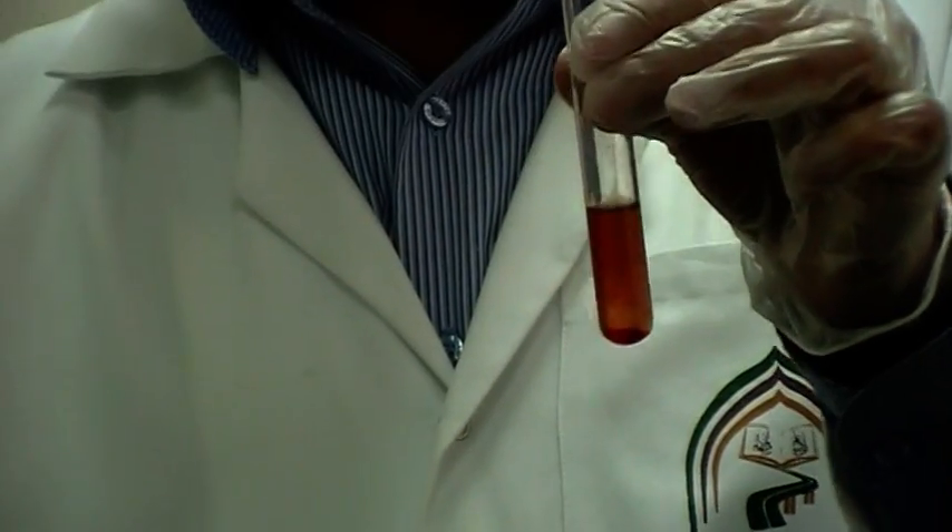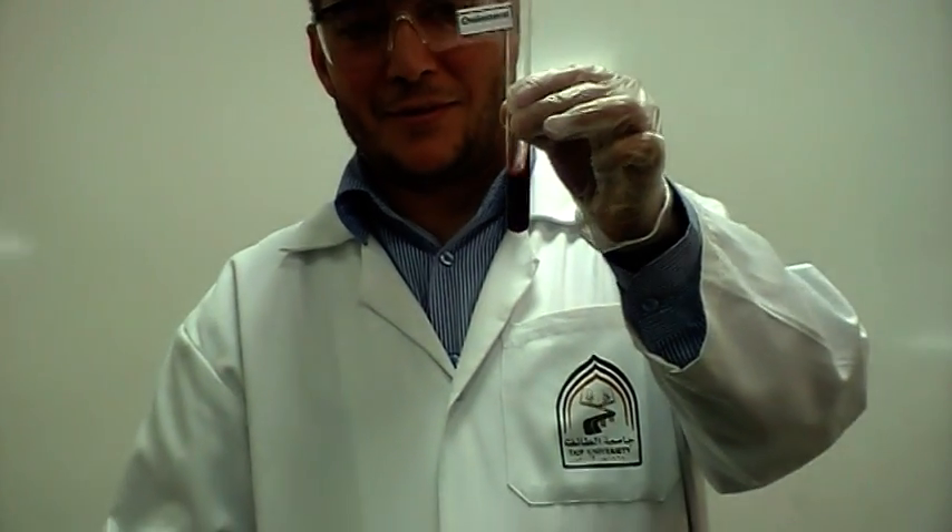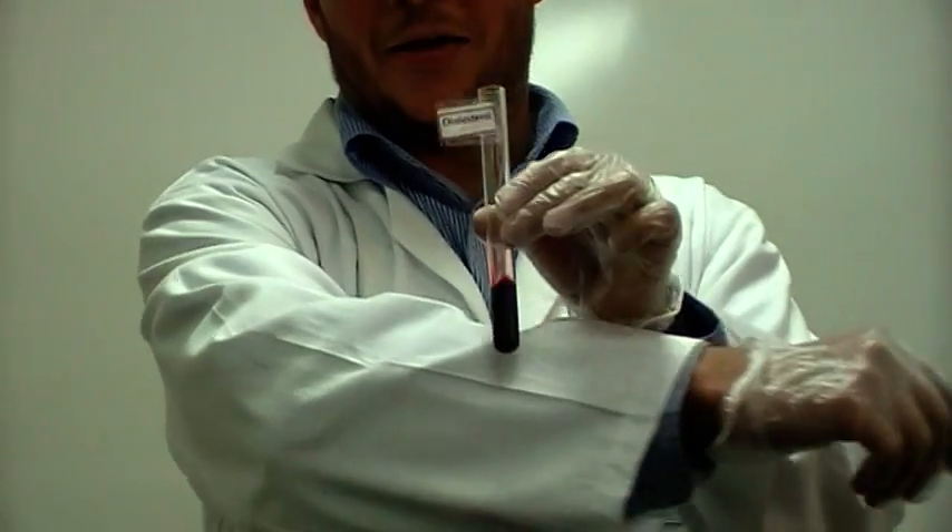Shake well. You get a deep red to brick color — this means you have cholesterol. Thank you.